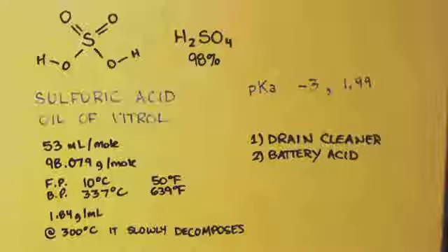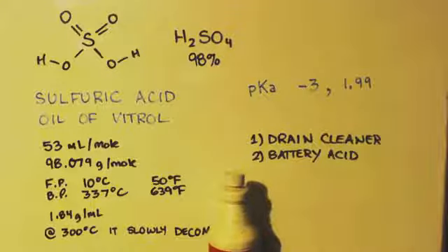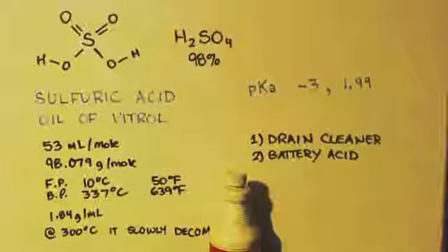What I do is I put it in a distillation apparatus. I don't know how Nerd Rage does it, where he distills under all that pressure. Every time I try it, my joints come undone and there's sulfuric acid leaking all over the place. So basically, I just do it till that point, right? I distill some of the water out, and the action of heating, boiling sulfuric acid will kill anything in there. Everything in there will be turned into carbon dioxide and water. So you can do it that way.